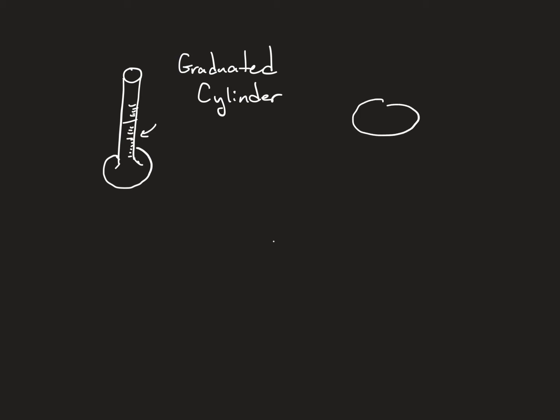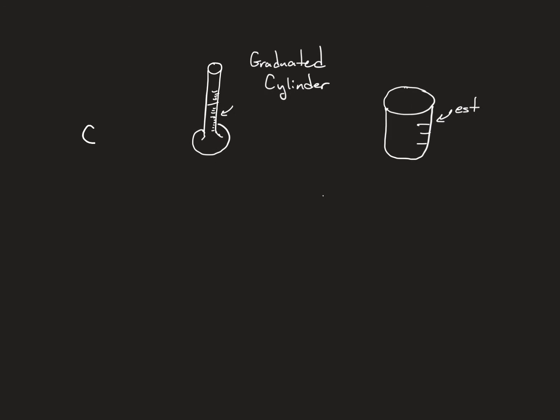With a beaker, often they do have marks. Beakers do. This is what a beaker looks like. I showed you an example of it earlier today. So this is a beaker. They also have marks, but these are just estimates. These are not accurate. What you used over here were bottles. You had bottles that had specific volume or specific concentrations here. These are just bottles.